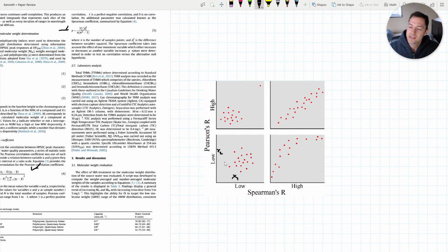So ideally, we want some correlation coefficient to tell us that there exists no relationship. The equations for those are here, but for the sake of this discussion, we can learn just from looking at it that there's no correlation.